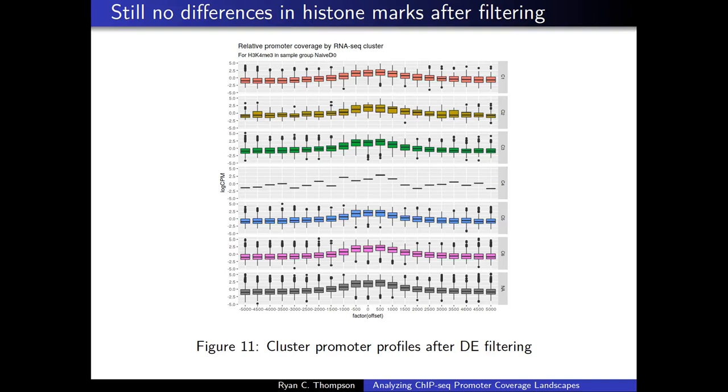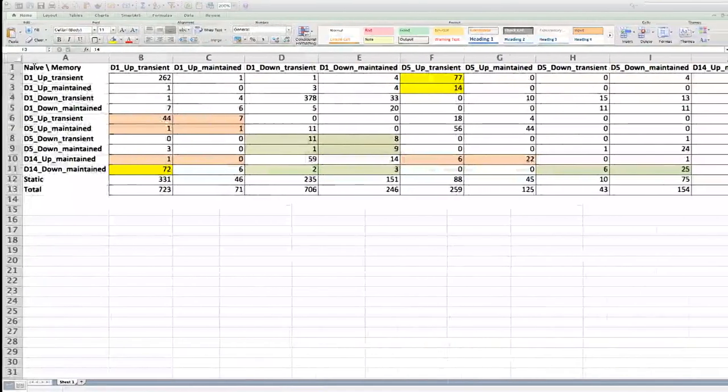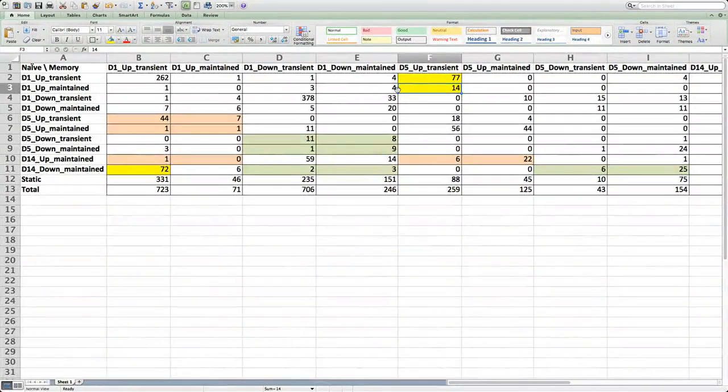And specifically looking for differences in day 0 between naive and memory, right? The question is whether some epigenetic mark in memory is poising. Yeah, so in the case of the red ones where they go up earlier in memory, I would look at the day 0 naive histone mark in the promoters. I would look at the same in day 0 memory, and I would try to find some sort of difference that represents the readiness of that gene to be activated more quickly.